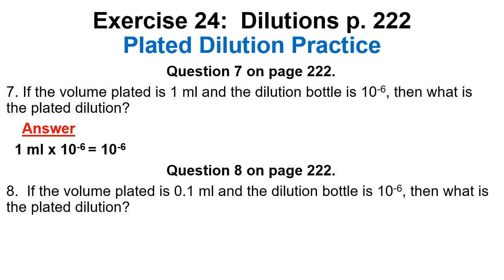Question 8. If the volume plated is 0.1 and the dilution bottle is 10 to the negative 6, then what is the plated dilution?